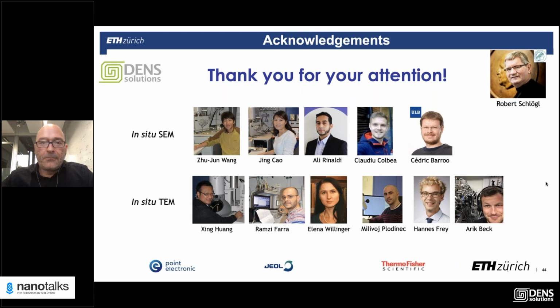You've also been using the Climate system for more than 4 years, since early 2016, and you've seen all the different versions of nanoreactors that we have produced over the years, starting with the first FEI Climate nanoreactor, and then when you moved to Zurich, you worked with the new nanoreactor, and lately you started using the EDS compatible nanoreactor.